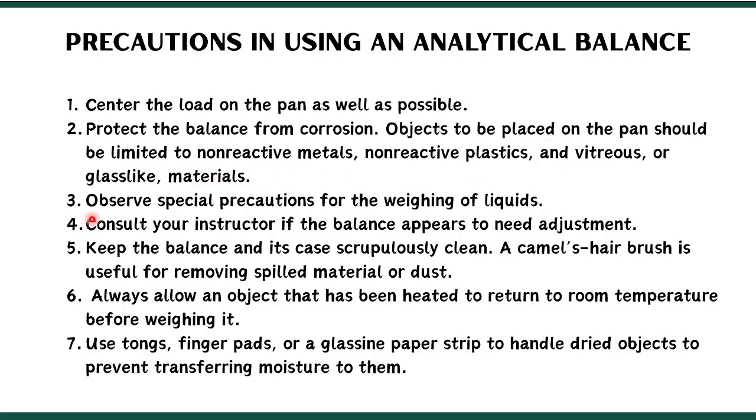Then third, we need to observe special precautions for the weighing of liquids and make sure nga walay mga usik, no? Walay mag-usik-usik, walay magbasa-basa, walay mga residues nga mahabilin sa sulod, walay lama-lama, no? Nga mahabilin sa balance pan.